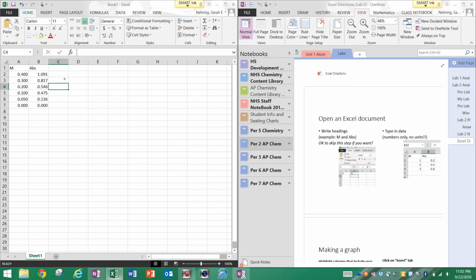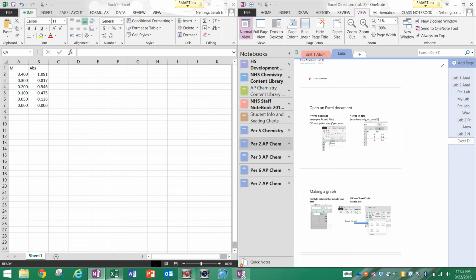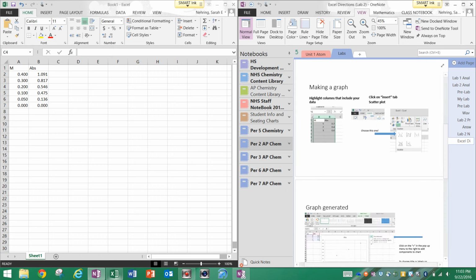All right, so I'm going to go back over here. I typed in my data. I'm looking at my directions here. And see if I can get this to scroll down. There we go. Okay. So, sorry, my screen was malfunctioning. So I typed in my data, and then I'm going to make a graph. So it looks like next step is highlight the columns that include your data.